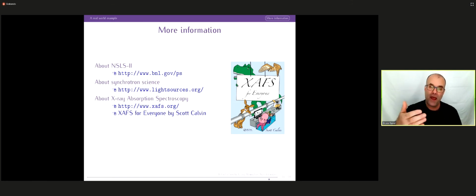And what's more, as you do a chemistry experiment on a bimetallic sample, one metal might respond differently than the other one. So one might start to oxidize or reduce before the other, and you can certainly see that in XAFS measurements. And the reason that works is because every element has its characteristic absorption energy so that you can measure each one individually. The other thing is that if you have a bimetallic sample, you can measure very different amounts of the metals. So they could be a 50-50 mixture, but they could also be a 1%, 99% mixture. And you can still easily measure both metals in the bimetallic sample. It's one of the great strengths of XAFS that you get to look at each metal in a sample individually.